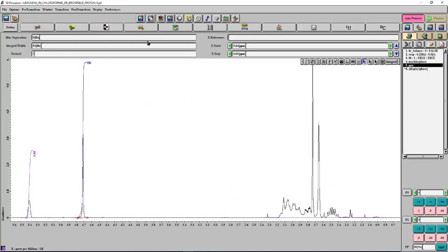Now, when I talked about this a little bit before, I also mentioned that you're going to see a whole lot of junk and multiplicities here, but you're going to see some singlets. Your singlets are going to be easier to interpret, but they're a little bit overlapping with things. With the multiplets, you're just going to have to try your best to interpret them.